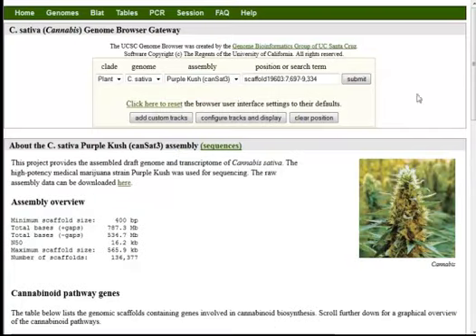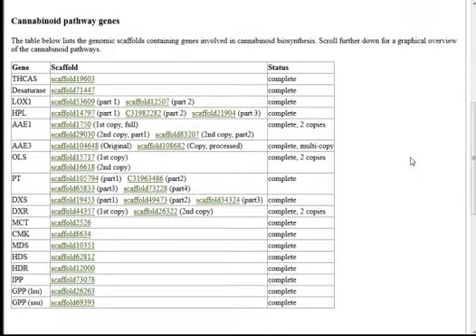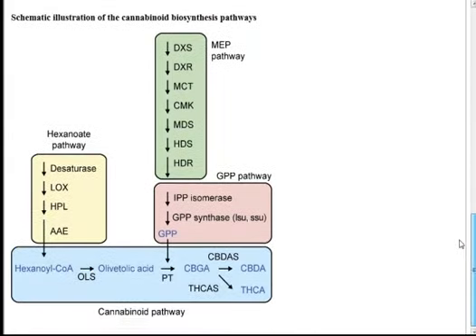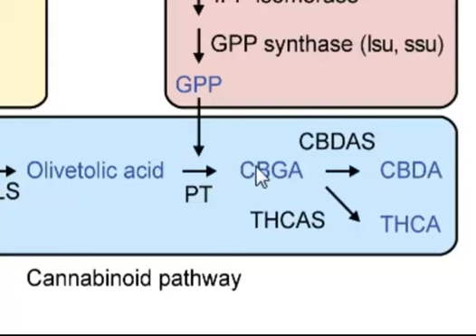One of the other great things this team has done is highlight a few of the important pathway genes. They know people are interested in these genes, so they've taken the pathway details — also available in the paper — isolated these sequences, and presented them in table form so you can look at any of these genomic regions. I'm going to highlight one of the differences they focused on in the paper. At the end of the pathway, there's a precursor molecule, CBGA, that can lead to THC if the THCAS synthase enzyme is used. This appears to be turned on and expressed in the medicinal marijuana plants.